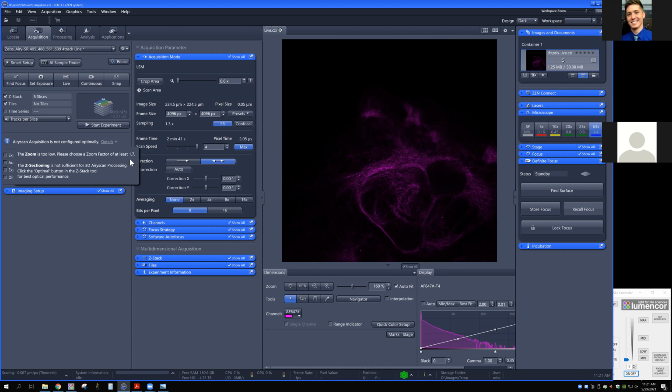So this is both for processing. This is for your sanity. This is for basically just keeping everything moving quickly, more or less. And it's warning me that the Z section is wrong. That's the other reason that it was no good. So we'll talk about that one in a second. All right, so I'll go back to my 1.7. Even if I click on 1, it's going to go there.